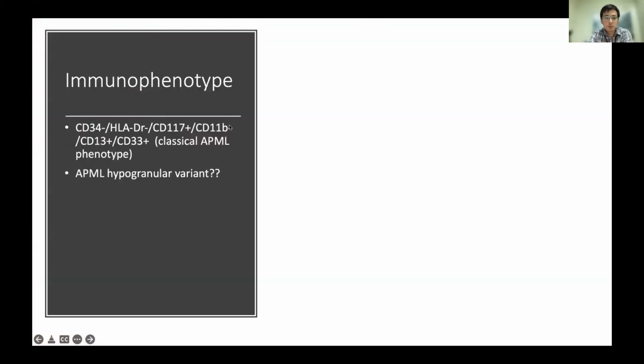So when we did the immunophenotyping, it was similar to the case that we saw in case number 2. The immunophenotyping is almost the same as case number 2, which is an APML. So are you happy to call this an APML as well, based on the first clinical suspicion from the referring hospital, and also a flow that is fitting into their differential diagnosis?